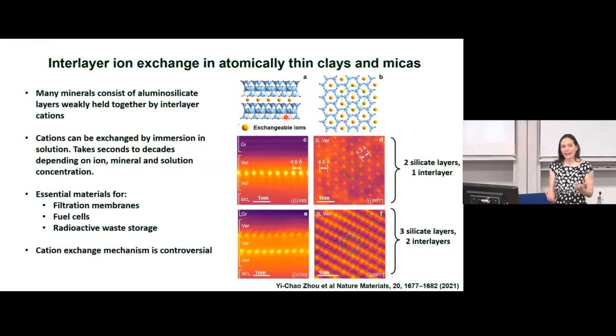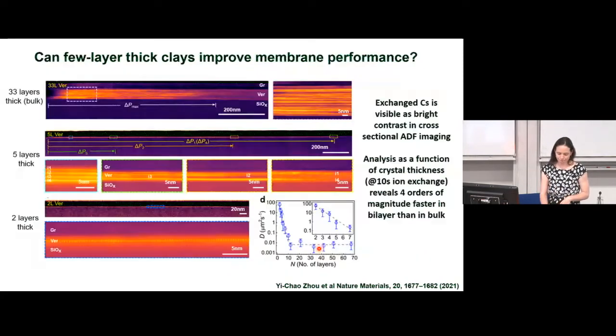If we have 3 layers of vermiculite, now we have 2 layers of intercalating cations, and we end up in plan view with these 2 layers superimposed, but with a small offset. And that's what gives you these lines in the pictures that you can see here. These lines are the offset of those 2 hexagons. And in plan view, again, you can see those 2 lines are offset, and we can see the 2 individual layers of cations. For anyone who does microscopy in the audience, these materials are pretty beam sensitive, and so you tend to get one shot at these types of pictures.